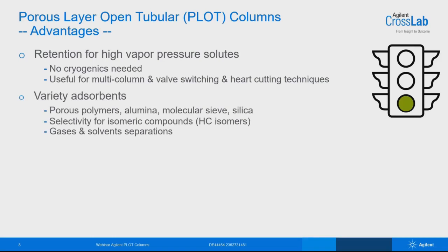There are many adsorbents that can be coated as a PLOT, and that means that you can target certain analytical requirements that you may have by selecting specific PLOT columns. We will go through them later in the webinar.